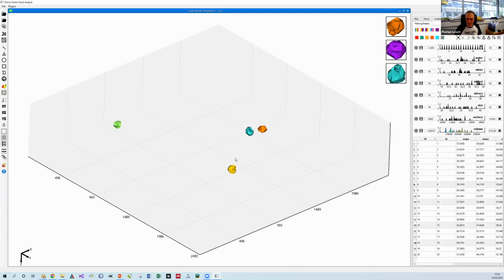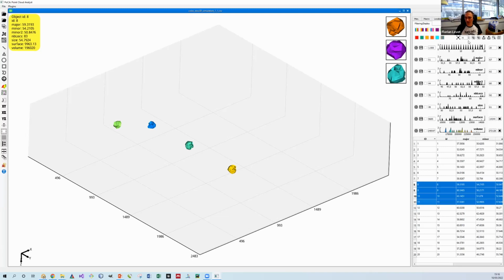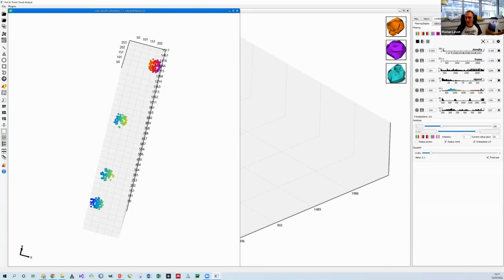When you do that, you see that you have lost the picking possibilities of your object. So you need to go back to this button here that allows the picking. And here it's in order to save the state of the object, so this list here, or to save the localization of the object. Something that you could also do by exporting, and then going to the localization and saving the localization here. So that's a different way to do the same thing.